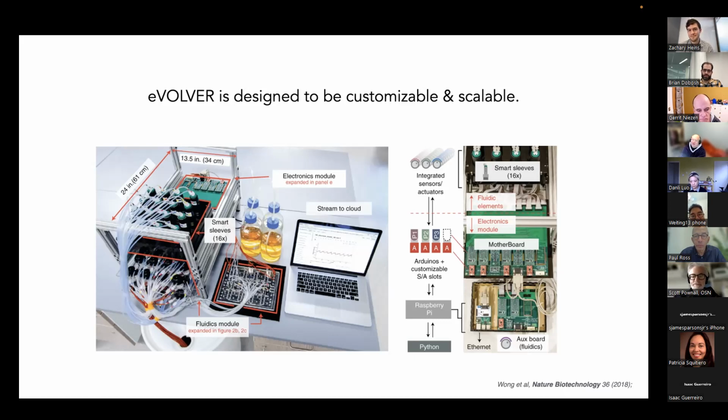So I'm trying to figure out a system, ideally to run in coordination with all these robots I was talking about at the start, the Opentrons robots, to enable a metabolic mechanism for monitoring the progression of bacteriophage.